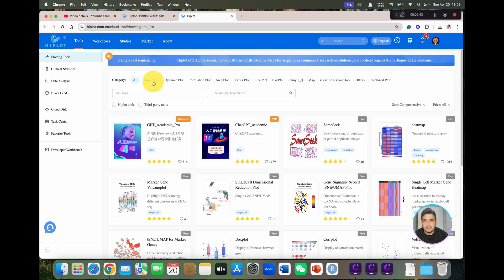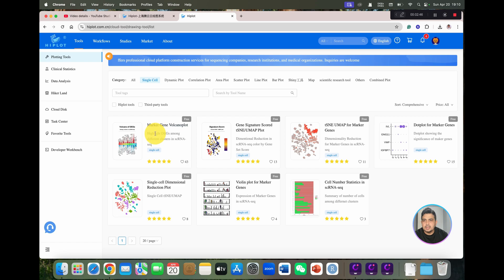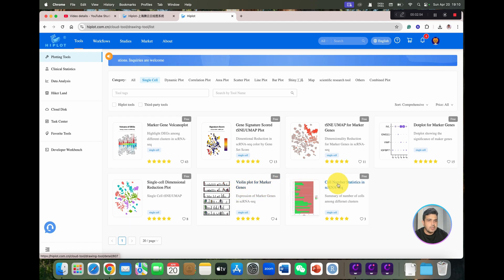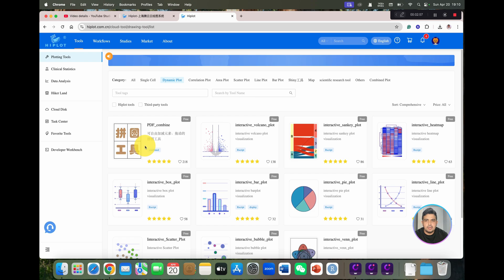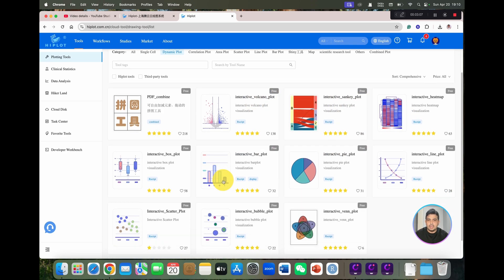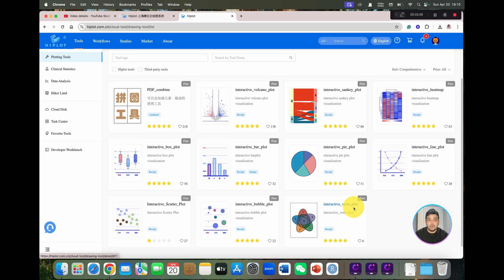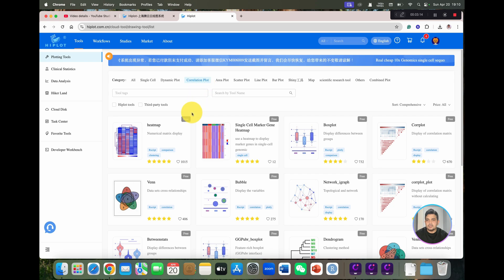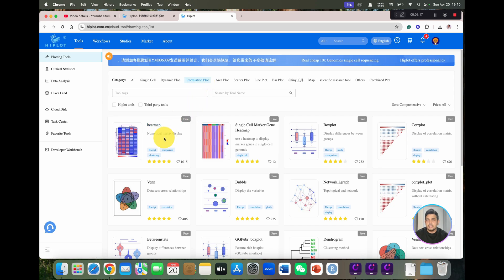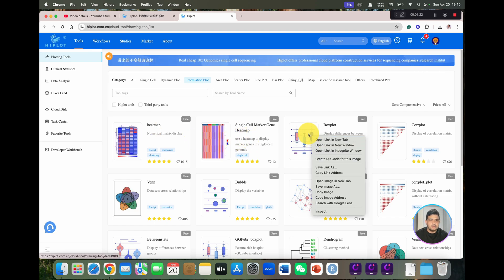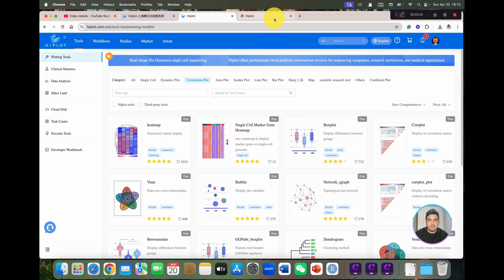You can see we can simply explore it by categories. We have some other graphs like violin plot for marker genes, dynamic plots, and you can see we can combine PDFs. We can make interactive volcano plots, Sankey plots, and a few more Venn plots. And we have different options for correlation plots in the form of different heat maps, and we have options for box plots as well.